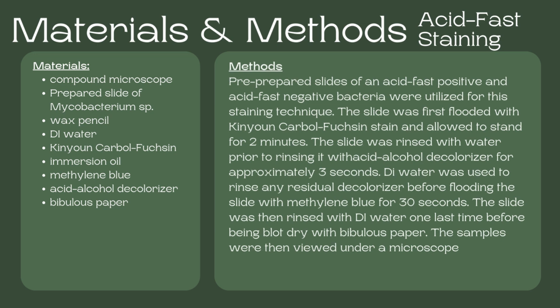For our acid-fast staining, we used a compound microscope, a prepared slide of Mycobacterium, wax pencil, deionized water, carbol fuchsin stain, immersion oil, methylene blue, an acid alcohol decolorizer, and bibulous paper. The pre-prepared slides of an acid-fast positive and acid-fast negative bacteria were used for the staining technique.